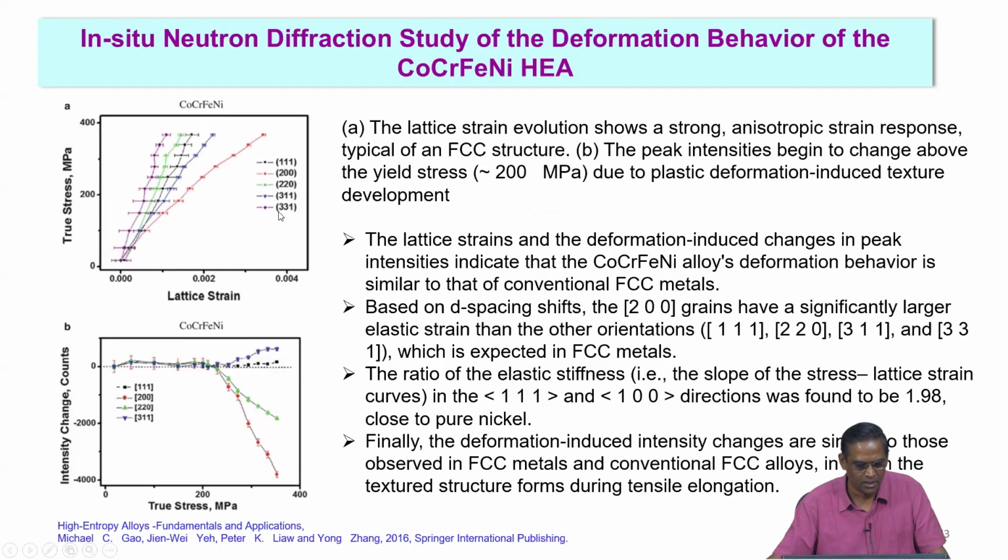And what is interesting here? This is the true stress, this is the lattice strain. What is interesting here? The lattice strain is significantly more in 200, right? It is very different from the rest of the orientations.